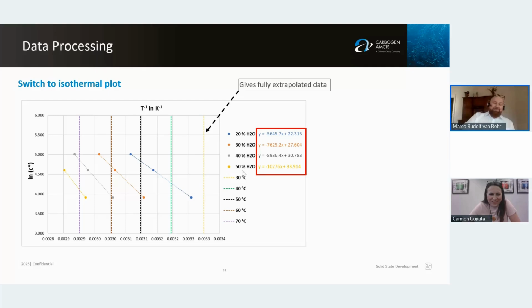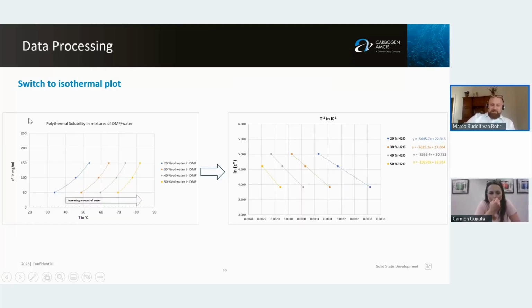Yes, that's possible. You just need to have the right software. For a presentation, it makes the most sense to have it like this, or, for example, you can plot this as a surface. It's possible, but if you have a surface, it's cool if you can move it around. Indeed. I made contour plots.